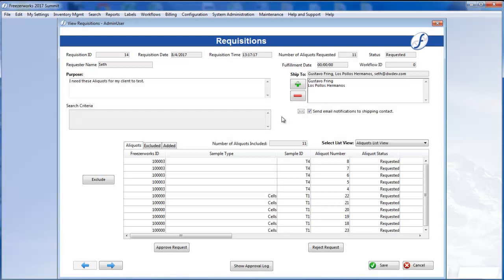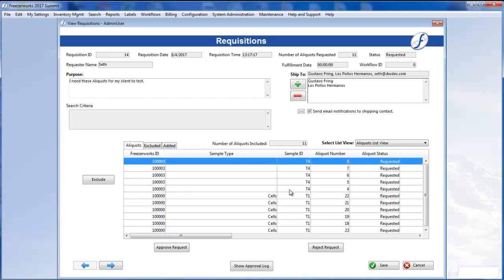You'll notice that you have full reign to edit the requisition, even though you did not create it. For instance, you may exclude any aliquots you choose to prior to approval. Let's remove all the T4 aliquots.